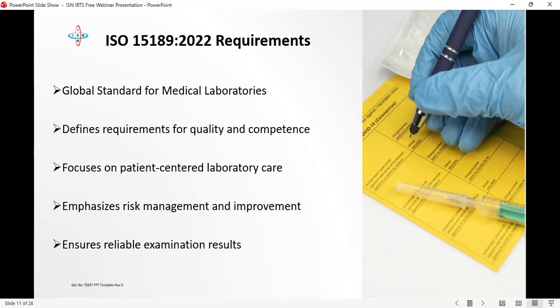It requires that we focus on our patient. It is not that we are looking at the tests that we are running. At the end of every test, there is a patient's life attached to it. It also emphasizes, you remember when Rufus was talking about the errors in the lab? It can be anywhere, and the majority of them happen even before the samples come into the lab. The labs are required to take mitigating steps to ensure that those risks do not happen.